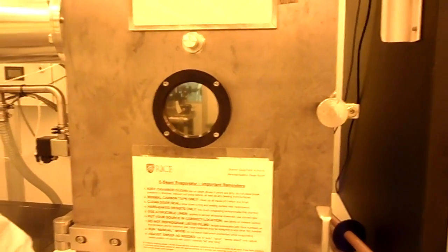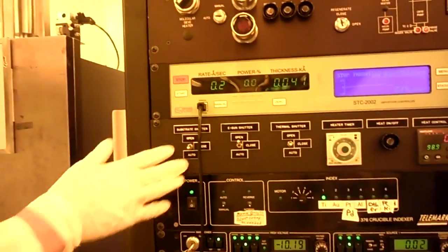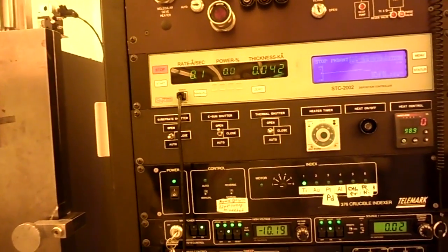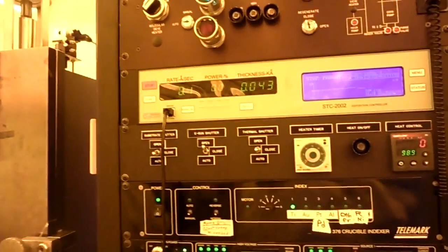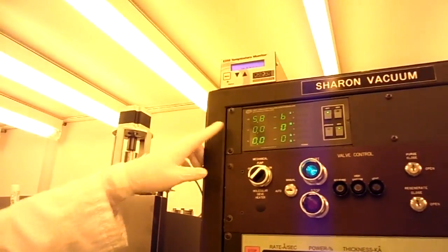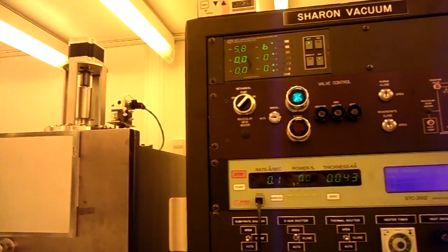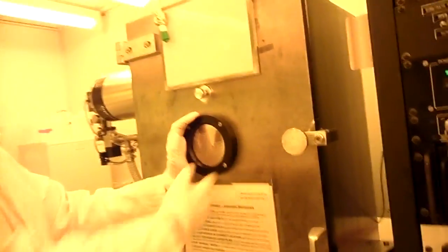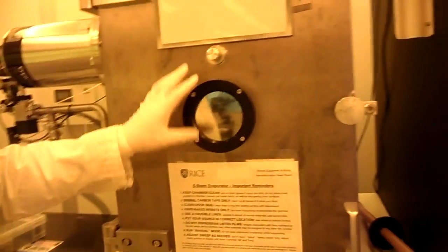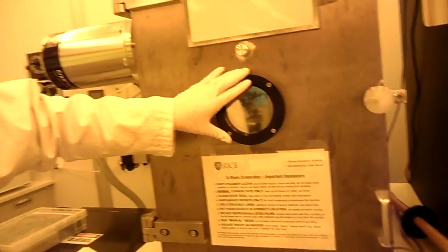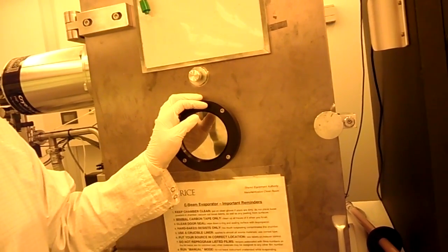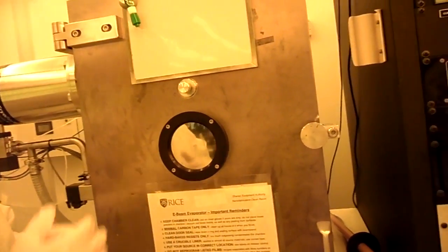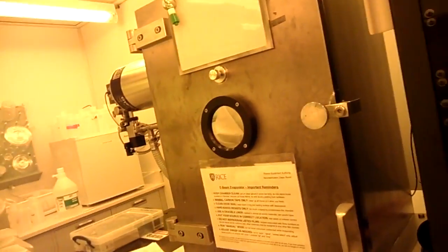You can see there's our base pressure is better. As the titanium cools, it traps some gases, and it's in a better place than where we started. Now, if you had a sample in here, what you would do is you would wait and monitor when that got cold. When it's no longer glowing, it may still be warm, and it would burn you if you tried to touch it, but it's not so hot that you have to be very, very careful. It's not glowing red hot. You should never open the chamber when something is glowing hot. Now, alternatively, if you were to do a second material, say we were going to do gold, you could, at this point, switch to gold without opening. Without opening. That's the nice part.